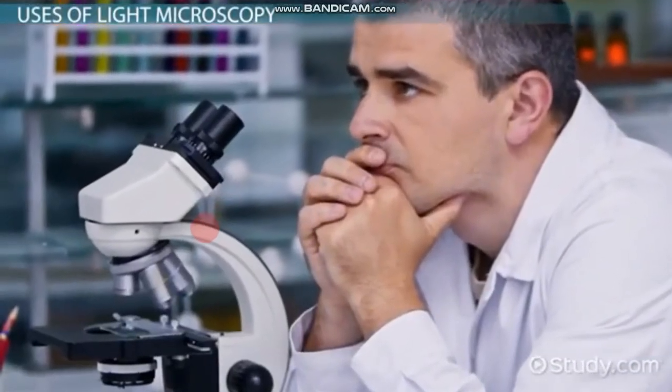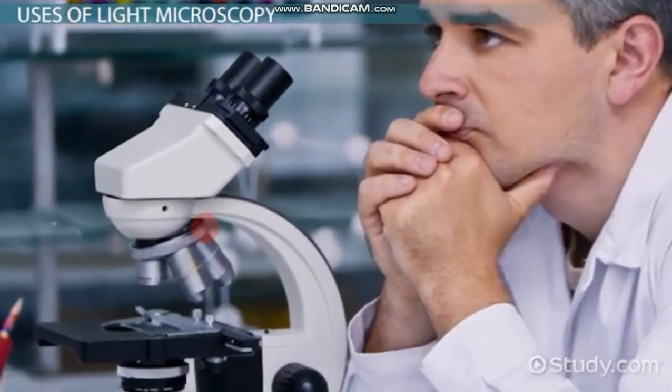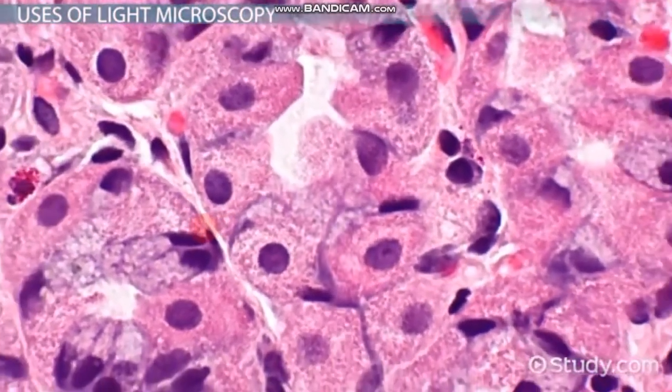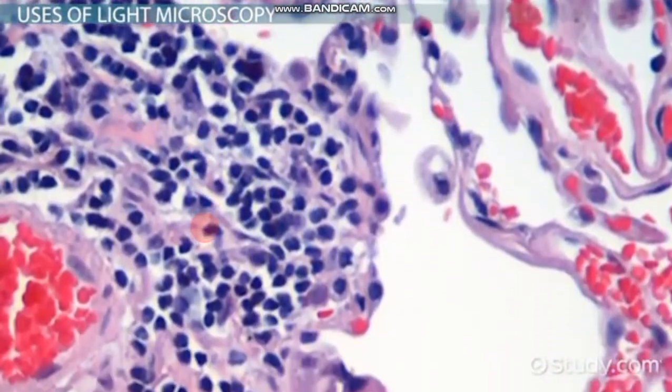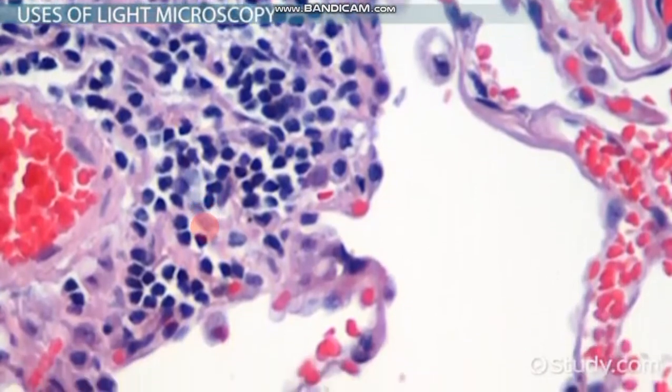Microscopes are essential tools for scientists. They are used in microbiology, material science, mineralogy, and medicine. A combination of staining and light microscopy can allow scientists to identify different kinds of bacteria.